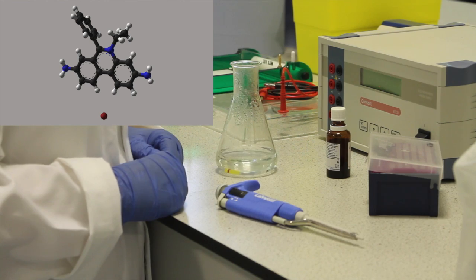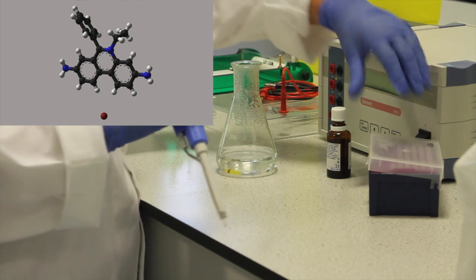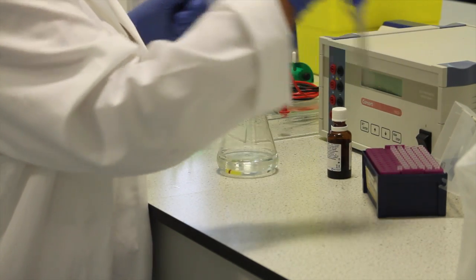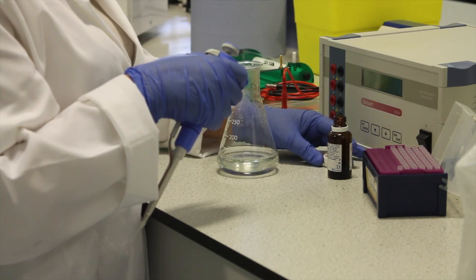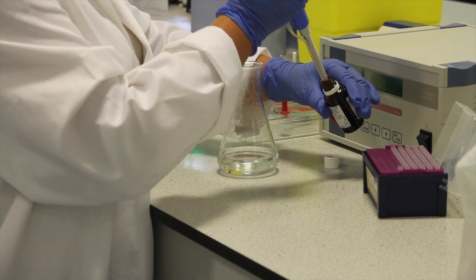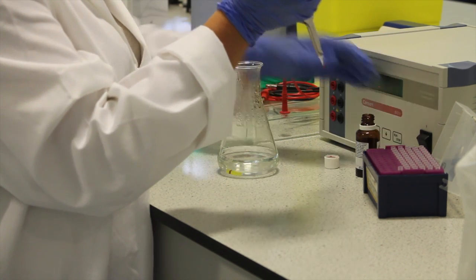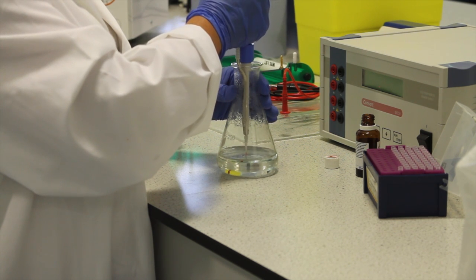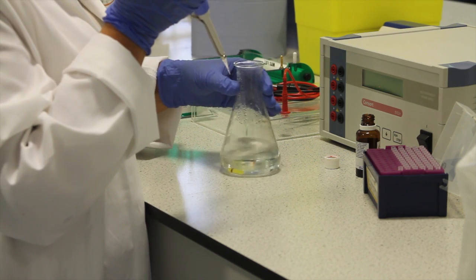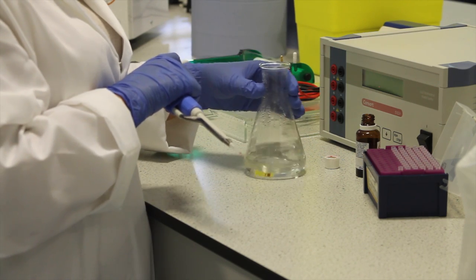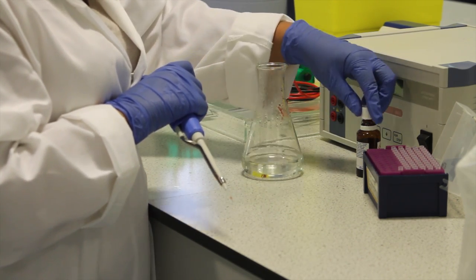Once the gel is cooled, ethidium bromide is added to the gel. Carefully add the ethidium bromide to the cooling agarose solution and swirl to mix. This is a carcinogen so immediately dispose of the tip in the sharps bin. Ethidium bromide will intercalate between the DNA and can be visualized under UV illumination, therefore allowing the DNA bands to be visualized after the gel has been run.